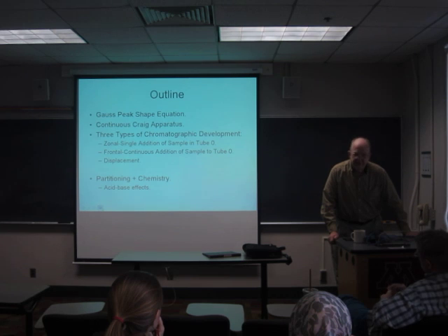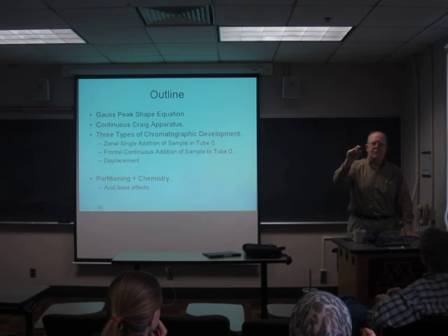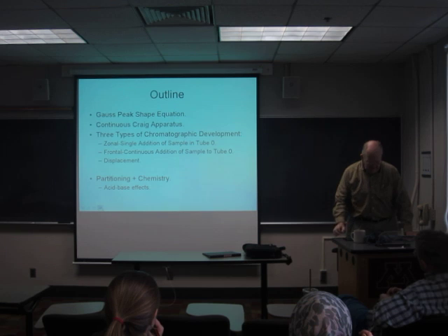We're going to talk about the zonal chromatogram, and this is where we just add sample to the very first tube, only once, to the zeroth tube. And then we keep adding fresh eluent. This is what's called zonal development.